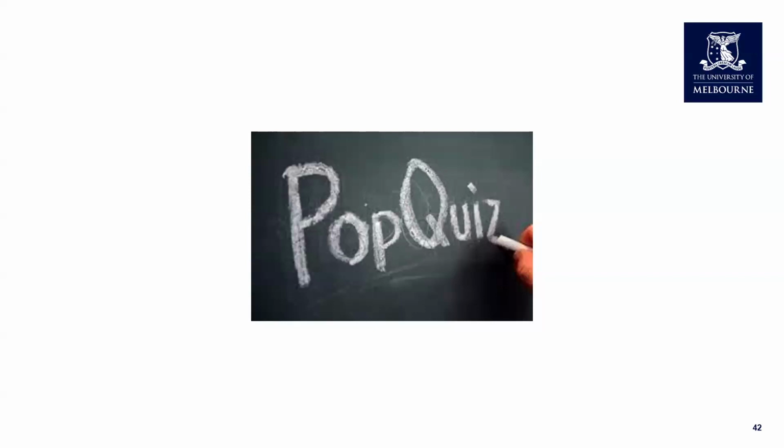I think most of you got that correctly because I can see the answers are divided exactly between the second and the fourth one. The difference between them is that once we found the correct algorithm, we actually want to apply just a single algorithm to all of our datasets.